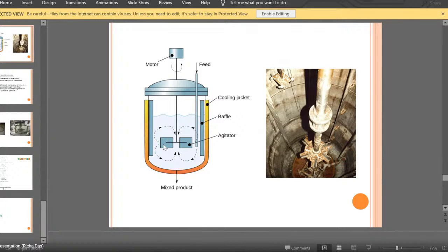Now, if the surface is rough, when the process of agitation is taking place, the microorganisms will start sticking on the rough surface, because they will get a rough platform to stick. Whereas if the surface is smooth, then microorganisms will not be able to stick. They will start slipping down because the surfaces are very smooth.